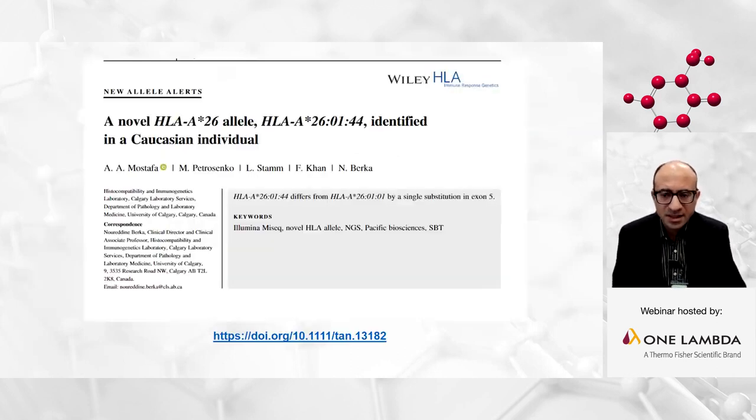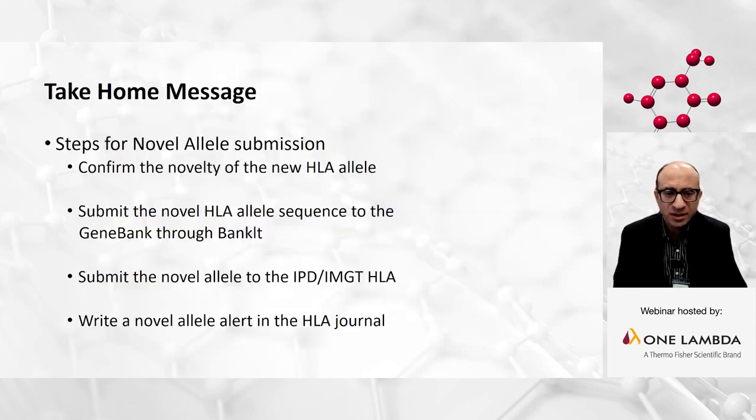And this is an example of an HLA allele report that we published, and the link of this manuscript is at the bottom if you're interested in seeing how it looks. And the take-home message of this is, you need to do 4 important steps before submission of any allele.